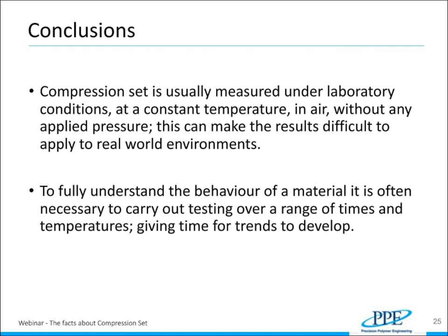need to consider how this behavior evolves over time. So we really need to test our materials for long enough that the trends develop. A few days here and there might not be enough to really see how the trends develop, to see the plateau points, to see whether we just get straight lines or we do indeed get plateauing results.